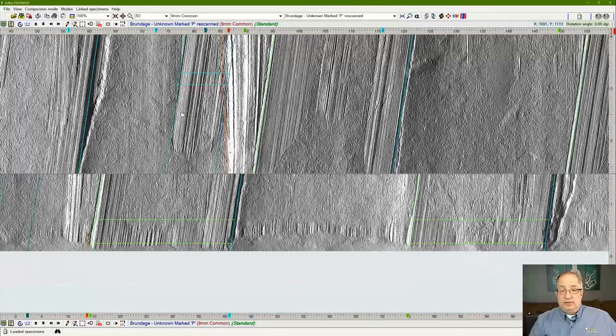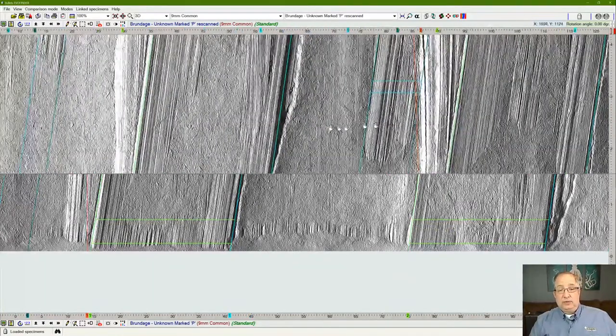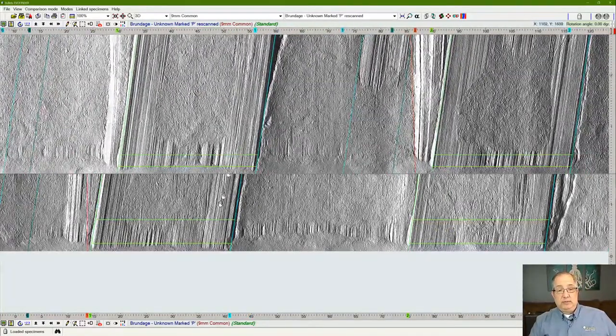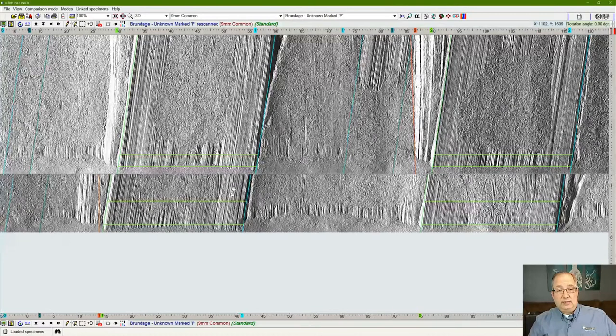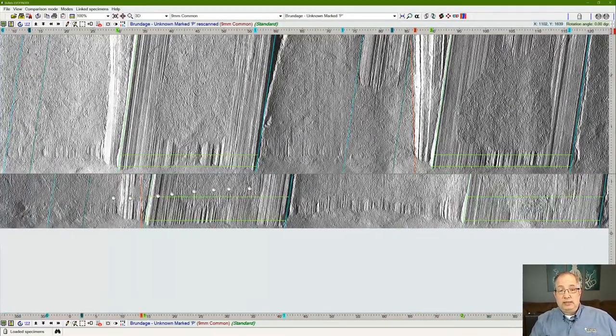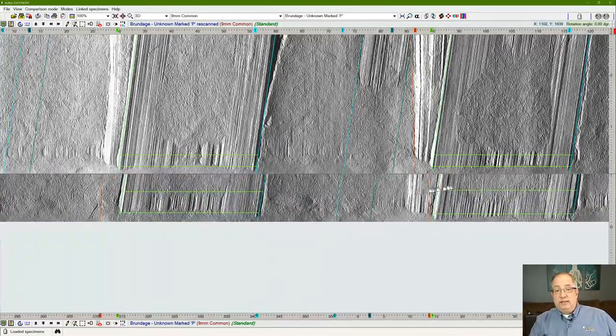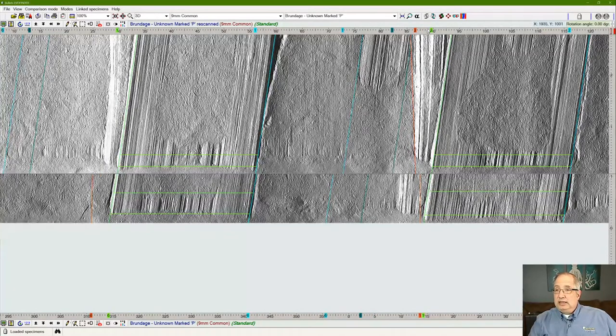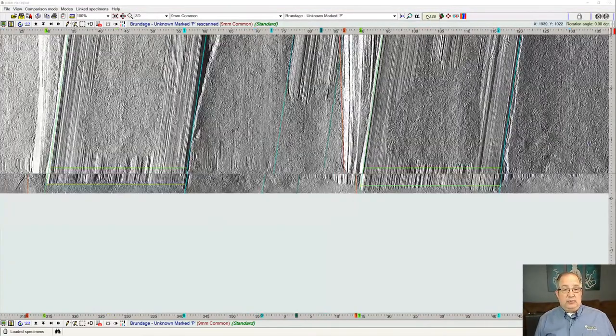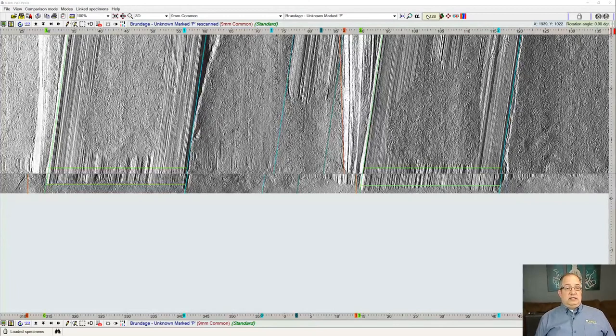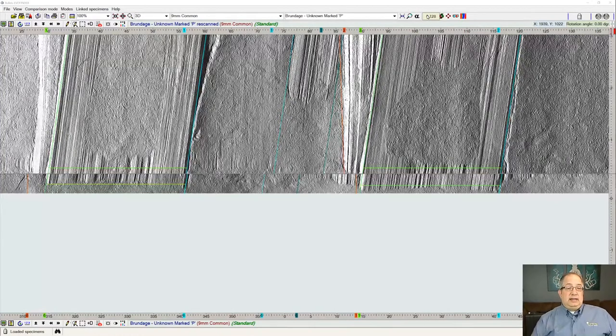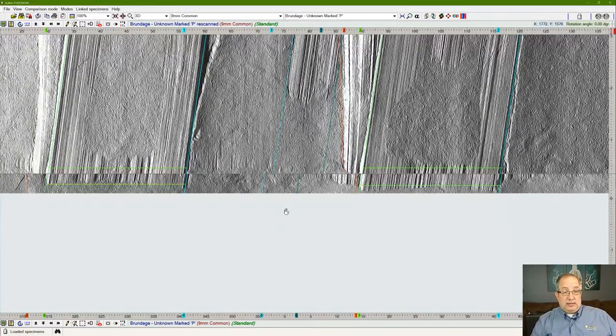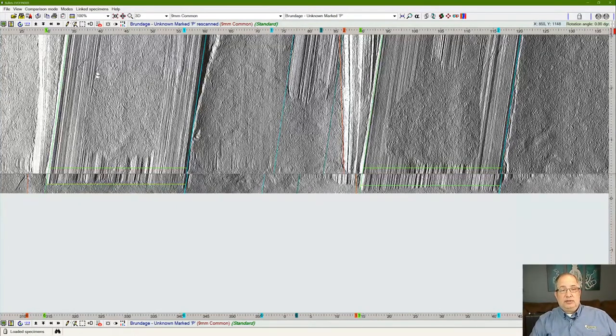The last thing that I wanted to go over is just a little more of the visualization controls for the bullets where if we wanted to use the system aside from the auto-identification function to align two samples, we can find similar samples to each other and then use the algorithms of the software to align them with respect to each other and see if it calculates the similarity that we didn't predict. Then we can come in and look at the comparison between these two samples and see if we want to make a determination based on the information that is available.